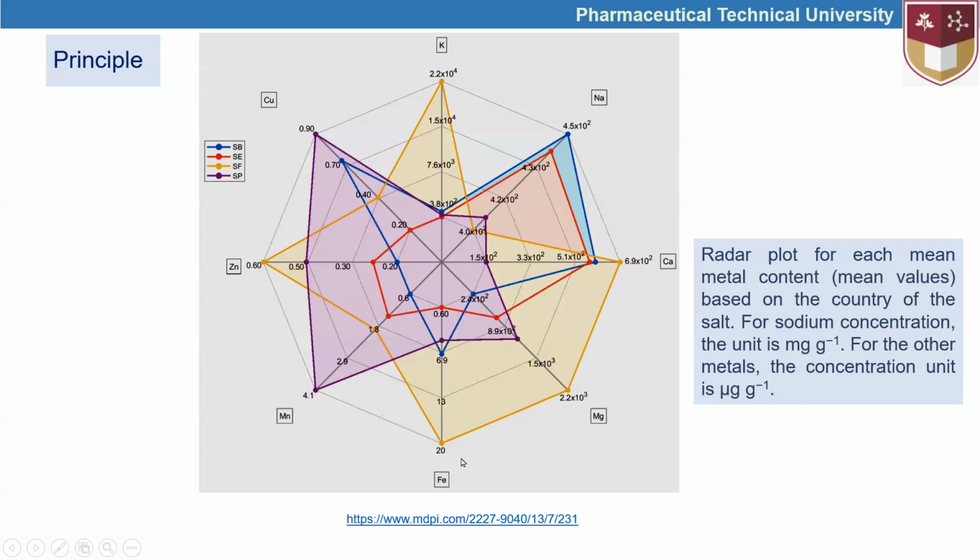If we use, for example, oxygen, we cannot claim the unique spectrum of atoms as we have been talking about in this lesson. The atomic emission spectrum can be more complex, so it could be difficult to identify the presence of different atoms if we provide the plasma with oxygen or some other gaseous atoms that could react with these metals easily.